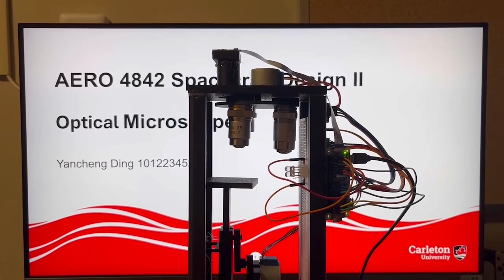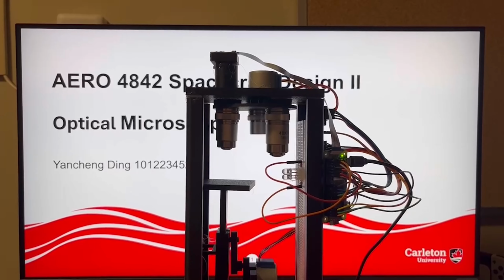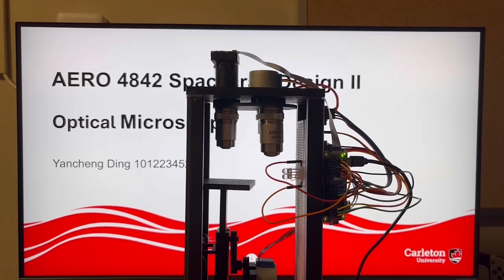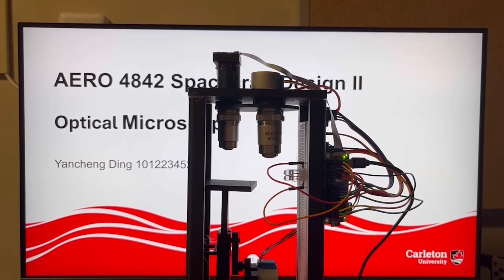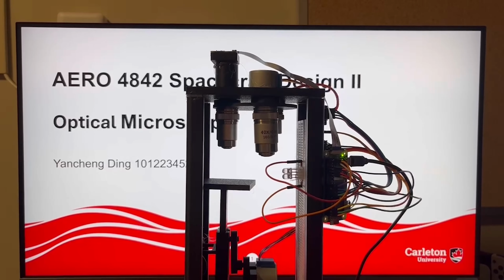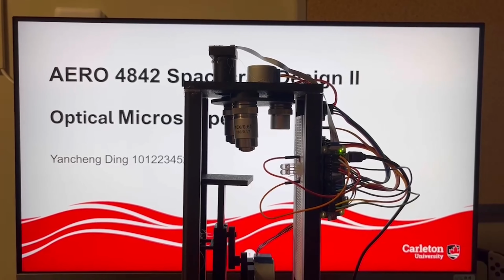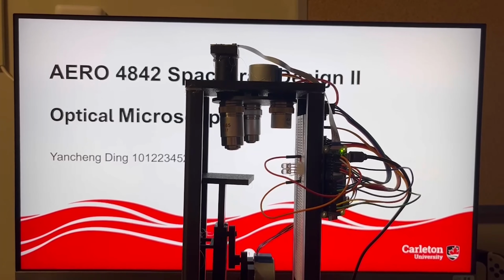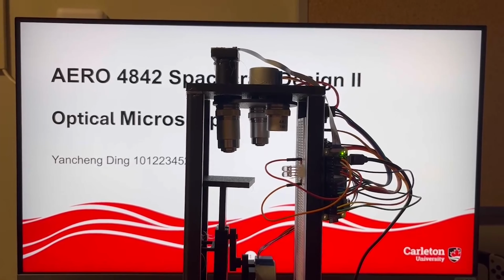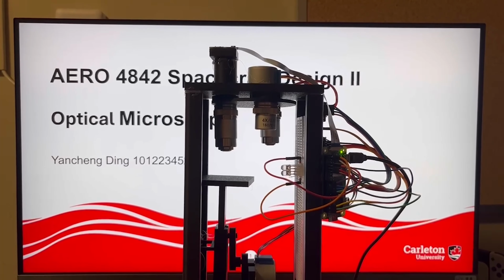So this is a video of actual lens switching in the project. As you can see, the stepper motor works and rotates the whole plate. It switches to the next lens and then stops to take images. Then it switches to the next lens and takes images again, over and over in this process. This ensures that all objective lenses are used, so we have multiple magnification factors.